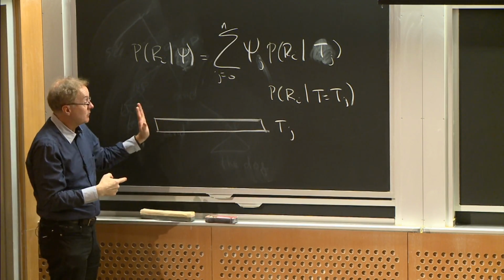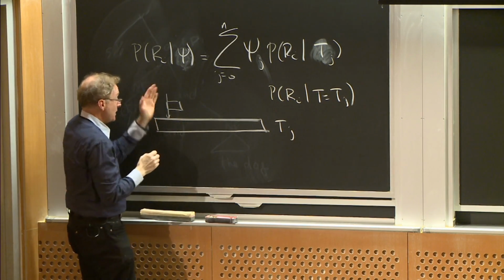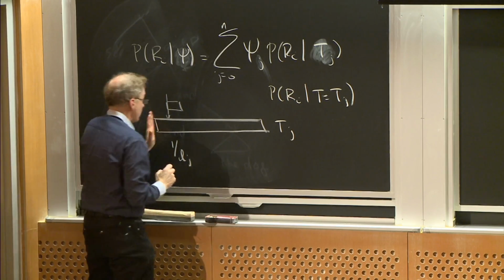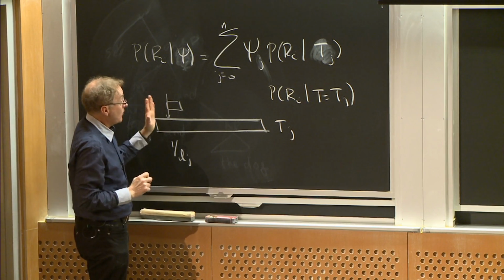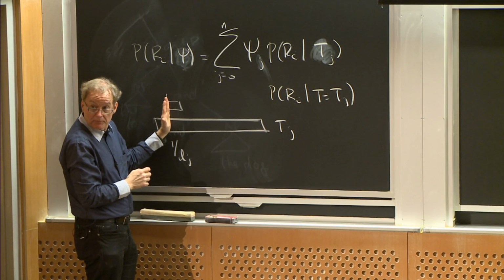What's the probability of observing a particular read? And the probability of observing it aligning at a particular position is 1 over the length of this transcript. And so the probability actually includes the idea of alignment at a particular position in the transcript. Okay?